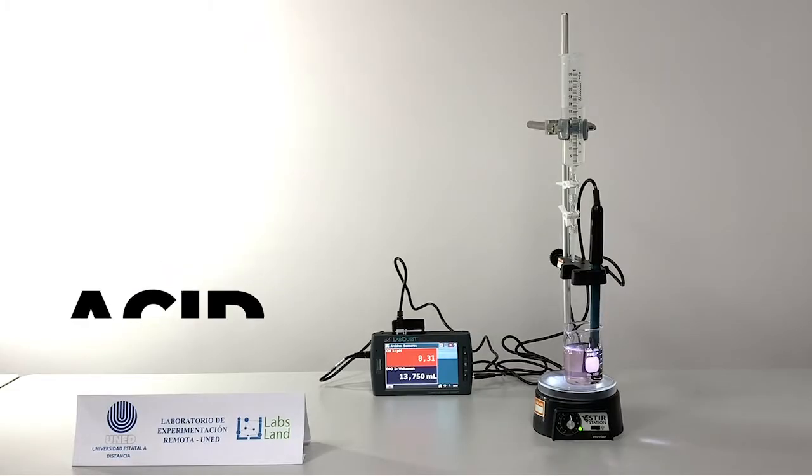Hi, welcome to the Remote Experimentation Laboratory of Universidad Estatal a Distancia. Today you will have the opportunity of working and developing the experience of an acid-base titration.